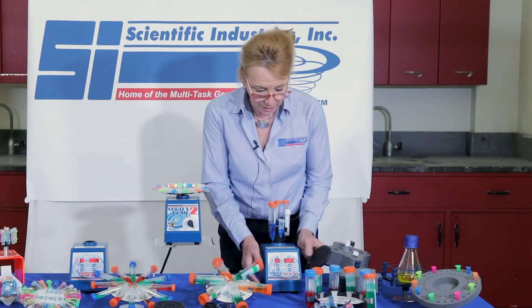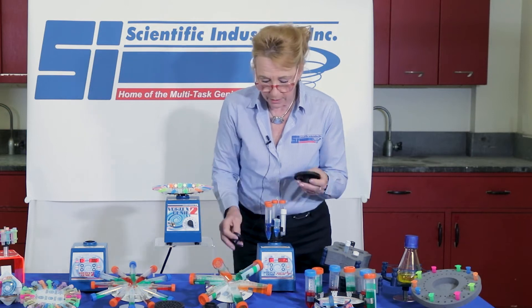The Vortex Genie Pulse comes with the cup and the platform, just like the Vortex Genie 2 and the digital.